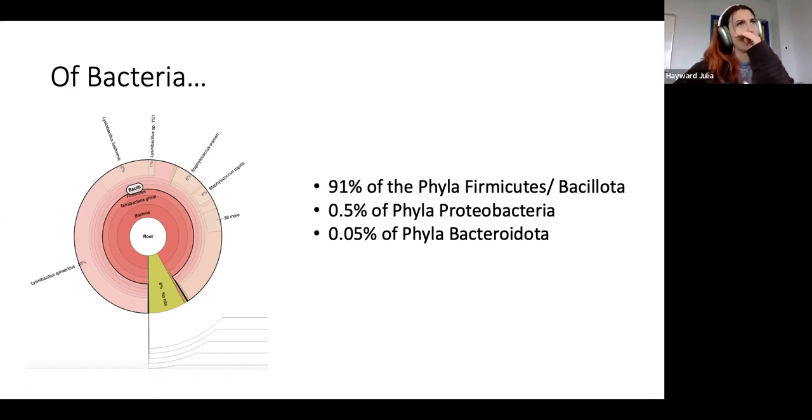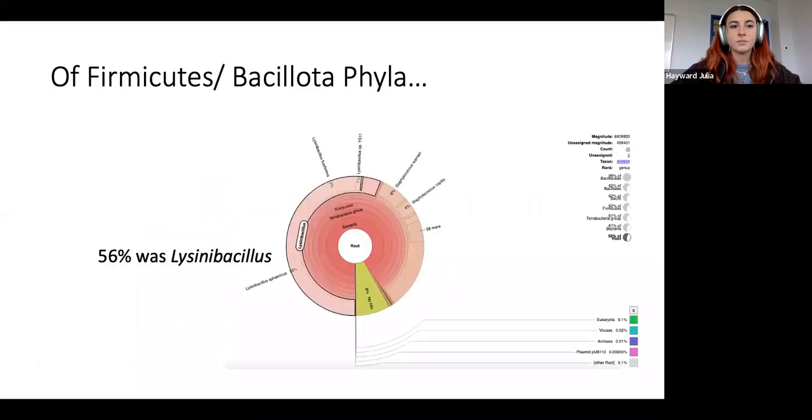I'm not too sure if that was sort of like a contamination reason, or if maybe, you know, I just had some like byproducts of walking to class, soil, pollutants, whatever on my face, but they were mostly gram-negative, the smaller percentages. All right, so now let's narrow in on the phyla.